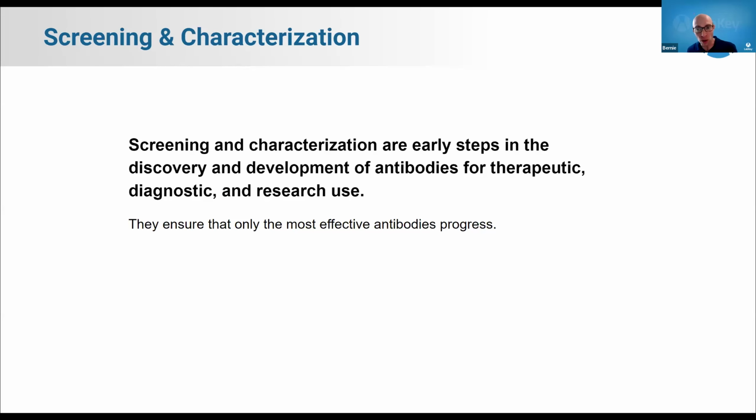I want to spend most of our time together today actually demonstrating some aspects of the product. But first, I want to set the stage just a little bit, since there's very likely to be some people here who aren't actively doing this kind of science. So I want to make sure that we all in general understand what's going on. We're going to be using some screening and characterization operations that are common amongst discovery campaigns in the early stages to demonstrate. But I'll briefly set the stage here.